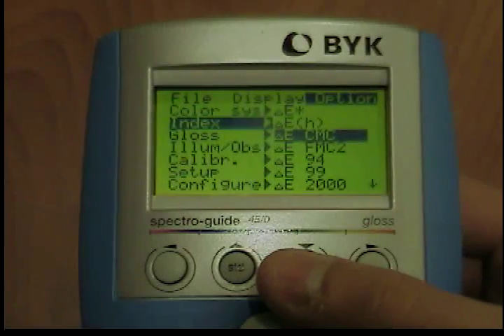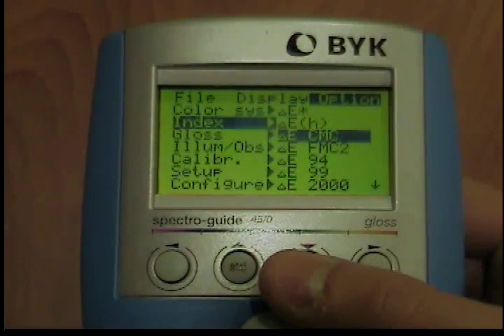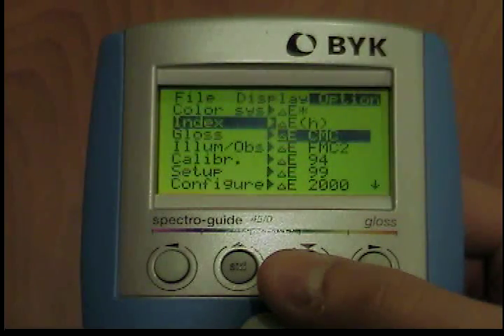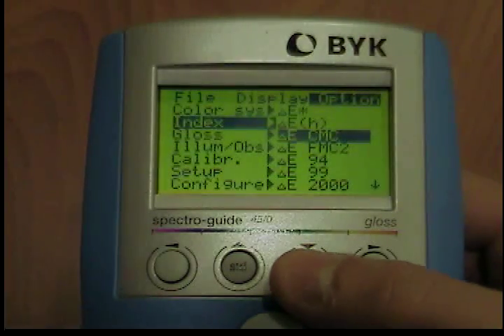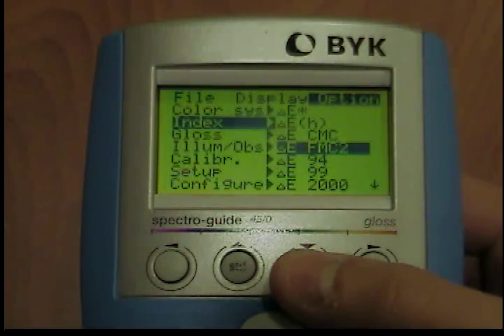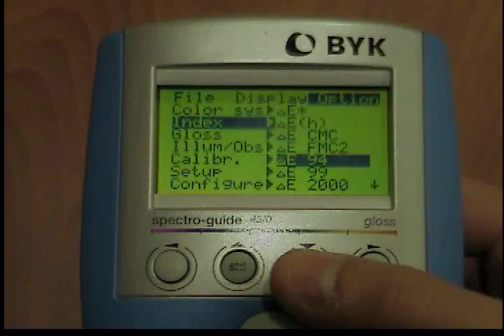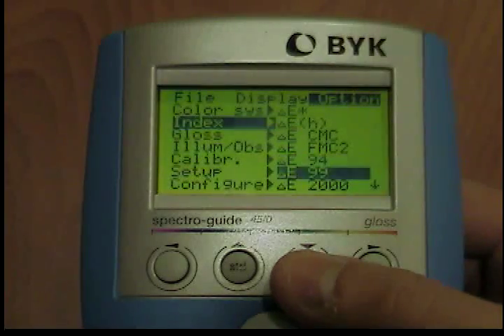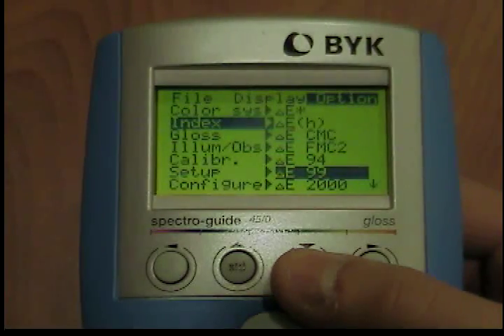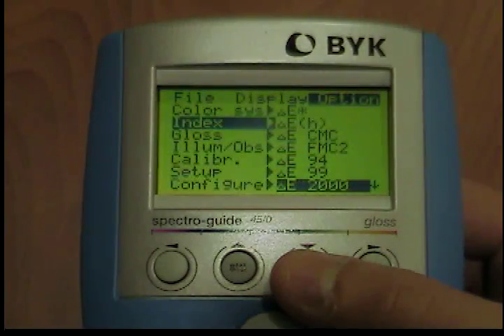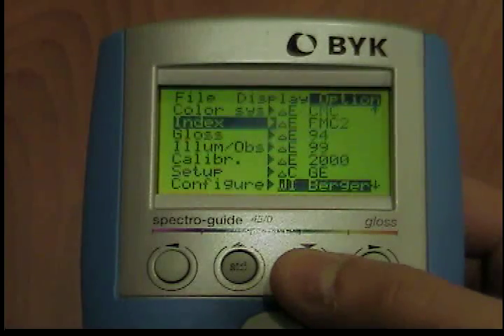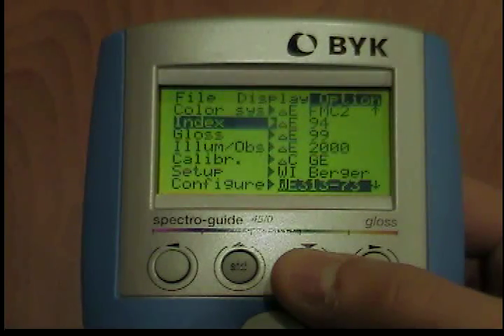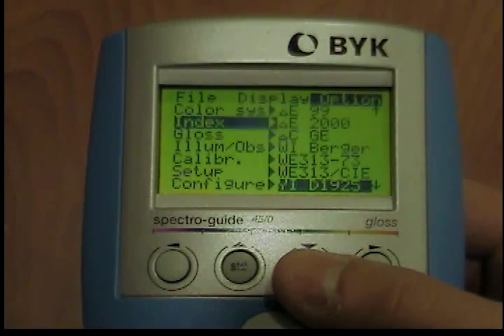Available indices are Delta E, Delta E-H, Delta E-CMC, Delta E-FMC2, Delta E-94, Delta E-99, Delta E-2000, WI Berger, and WI CIE.